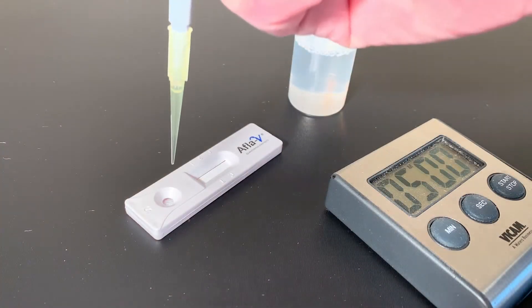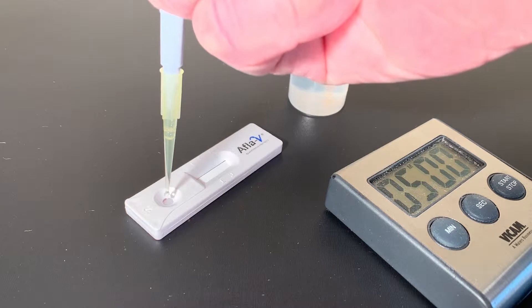Pipet 100 microliters of extract to the sample well on the strip, 1 drop per second.